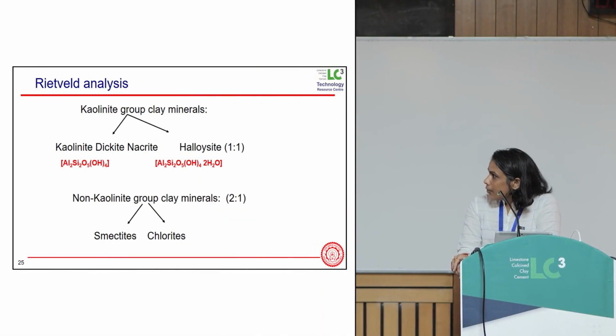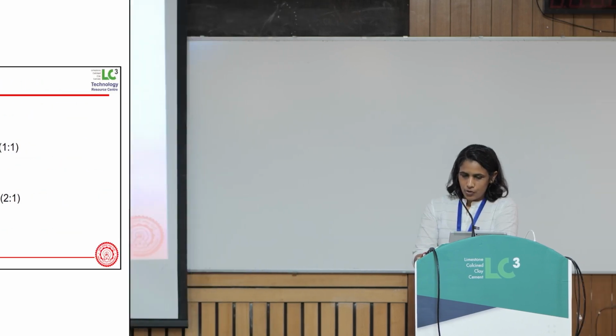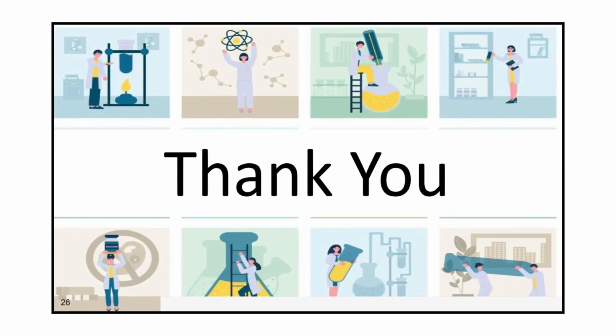And here I have mentioned some of the phases that we can add to the Rietveld analysis while quantifying the phases using XRD. Thank you.